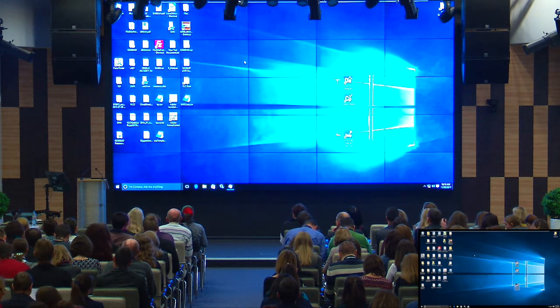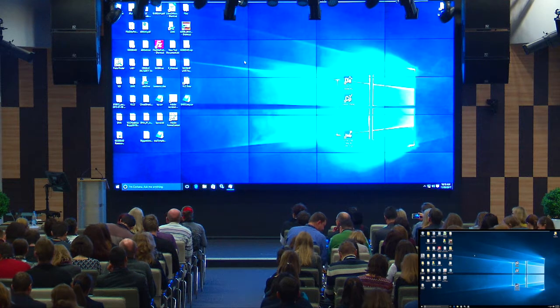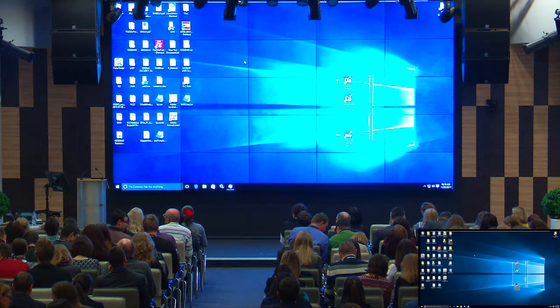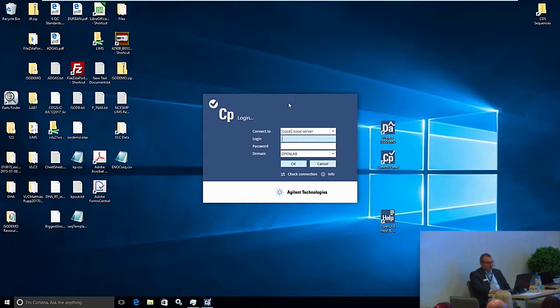Okay, so what we see here is pretty much reflecting what I was showing as my last slide, a client-server system where we can, from any PC in the lab, enter the system. And typical for a client-server system, we have to do something which is called authentication. Not each and everybody can run the software. We do have an entry point through our control panel where we have to authenticate to the system and simply supply a username and a password.